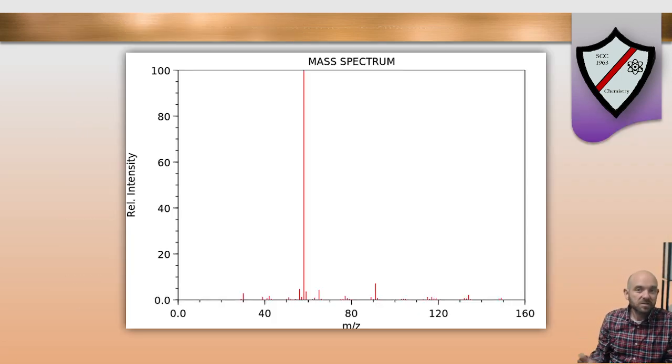So I like to start with a little bit of an example that may seem on the surface a little far-fetched, but really, if you look at where this science is going today, isn't so far-fetched. And I have an example here. What you are looking at is the mass spectrum. It's the output of mass spectrometry conducted on some unknown powder.